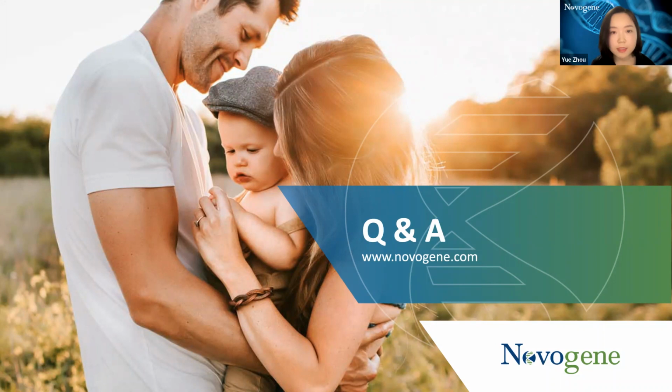If it is just using different software from our bioinformatician side, we're very careful about this. You can just tell us about the software that you're interested in using, and we can definitely help you to test it and tell you about the feasibility and also to adjust the parameters, etc.